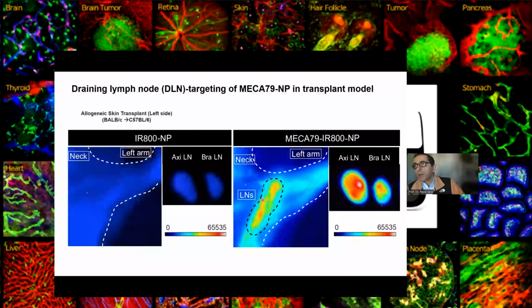with nanoparticle delivery is that the initial idea was that the particles pass through the highly fenestrated, permeable vessels of the tumor. But now we know that these vessels are not that permeable, right? Because there's so much fibrosis around it. And because you can see the collagen in these tumors, I was thinking that some of the big questions we can answer through live imaging are how these particles pass through this collagen and how they get to tumor cells.